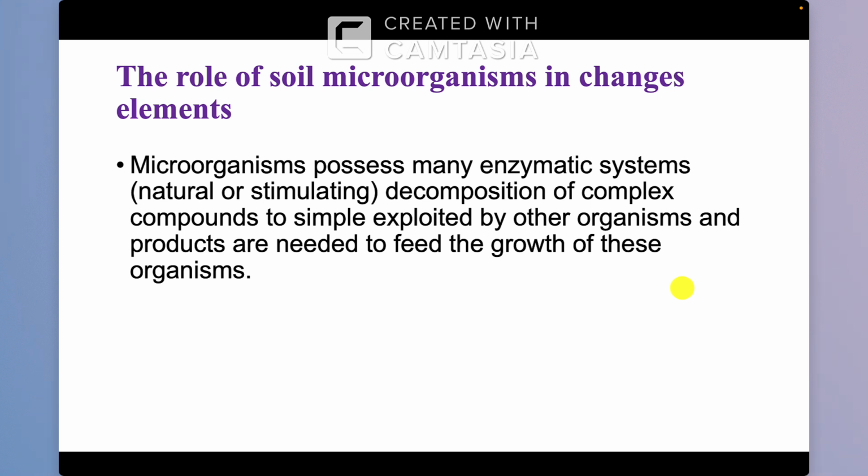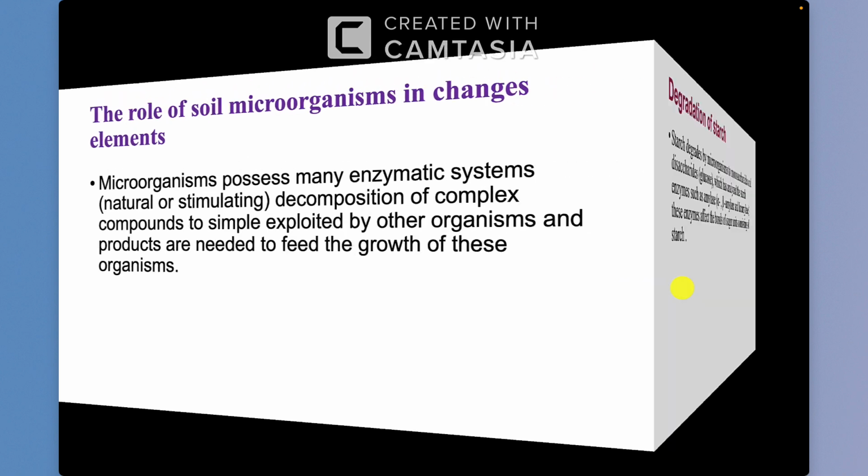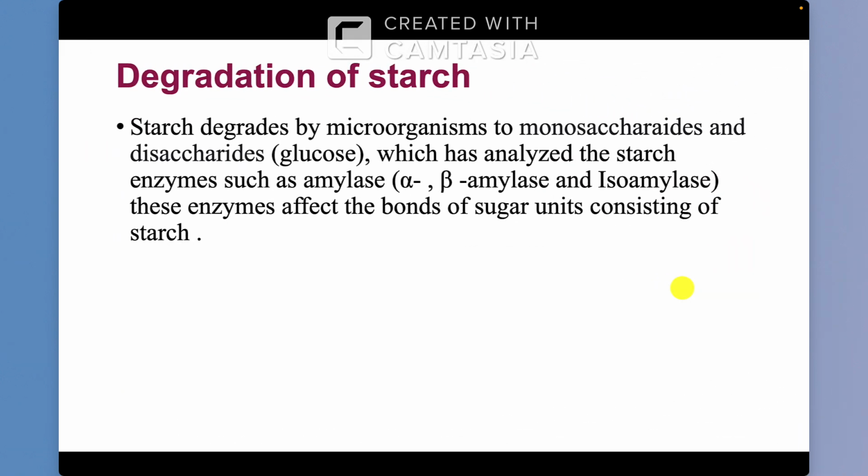Microorganisms possess many enzymatic systems, natural or stimulated. So decomposition depends on these reactions and on the importance of enzymes as well. One of the enzymes which microorganisms produce is the focus of today's practical lab: the degradation of starch.